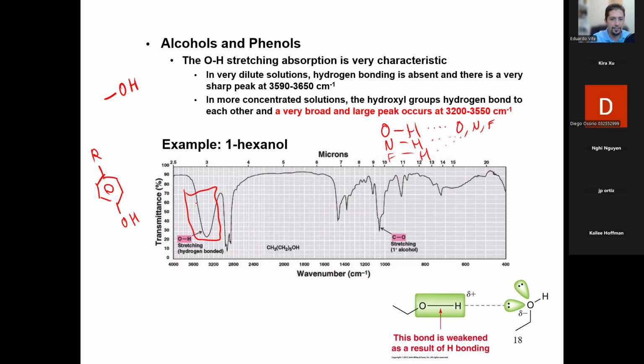And notice here, right next to it, you have the characteristic CH stretches. Right here in the green. Remember, this is always going to show up in all of your spectra. This tells you nothing. It tells me that this is all you know, and you don't get points for that. This does not help us. Obviously, there's a CH stretch because it is a hydrocarbon. It is an organic molecule. But what else can you see?